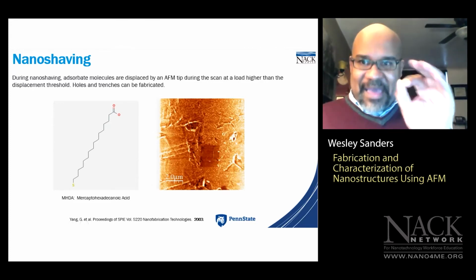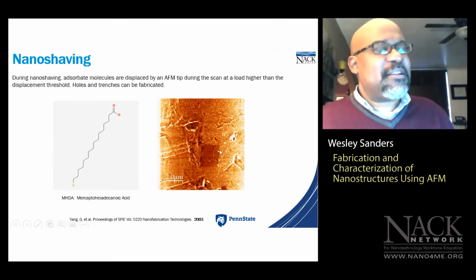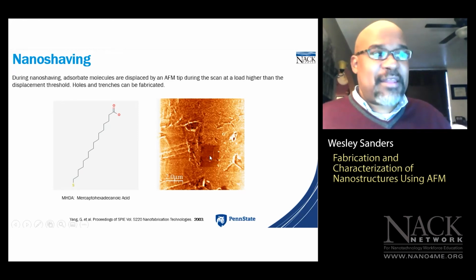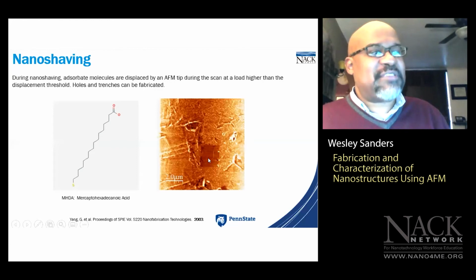facilitate the sticking of bacterial cells. Because at that time, I was conducting research involving metal-reducing bacteria such as Shewanella and Geobacter. And those bacteria, they grow in colonies. So we wanted to image one or two cells at a time.